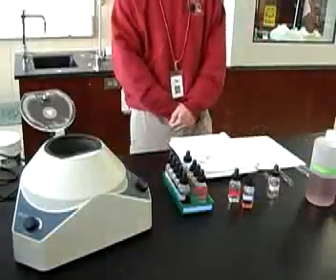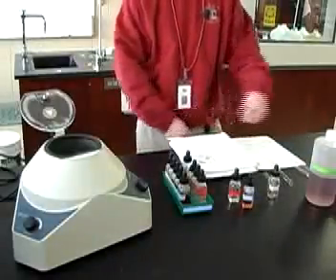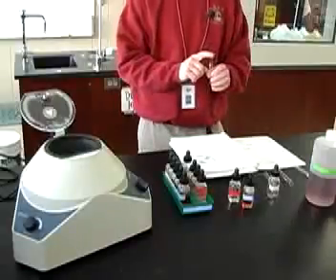Storing solutions. If you wish to keep a solution until the next lab period, make sure to stopper the test tube with a cork stopper.